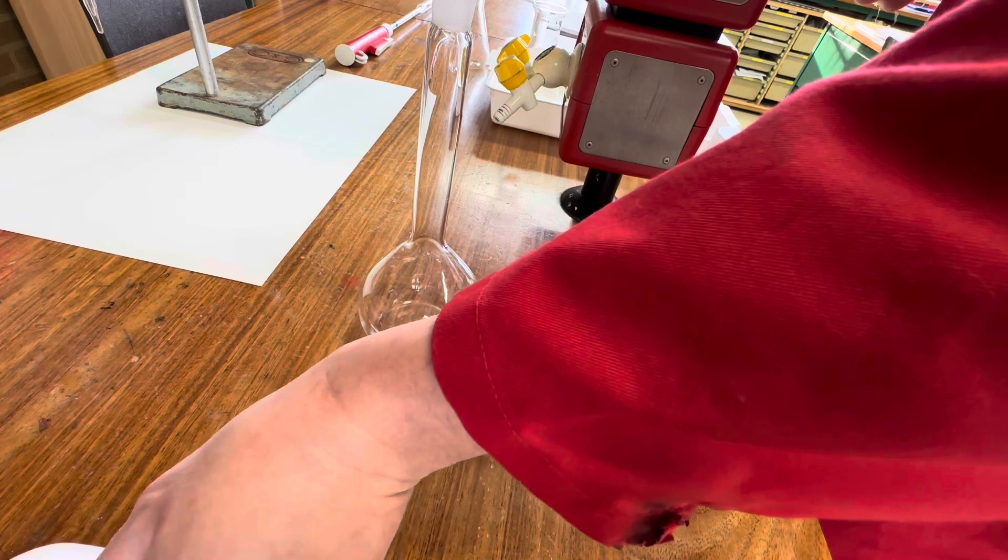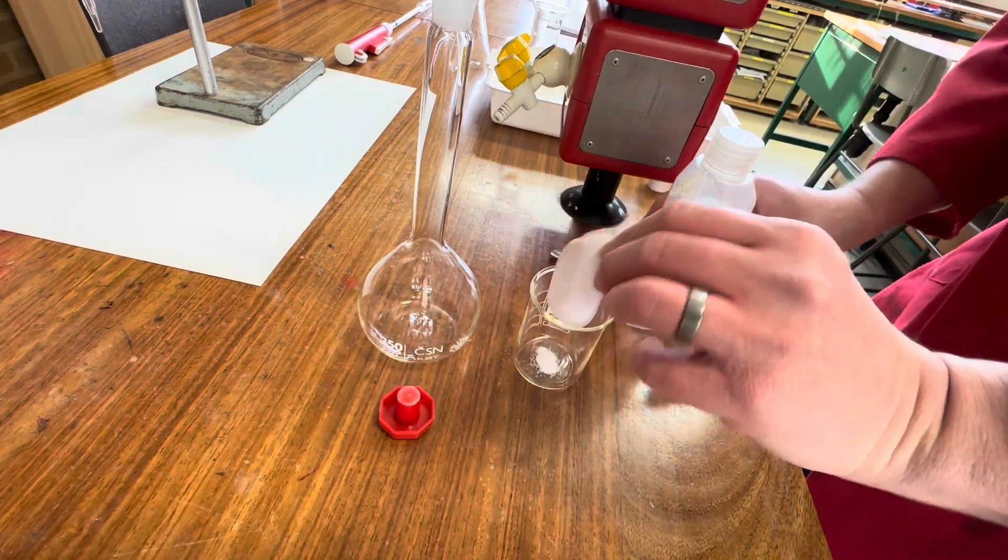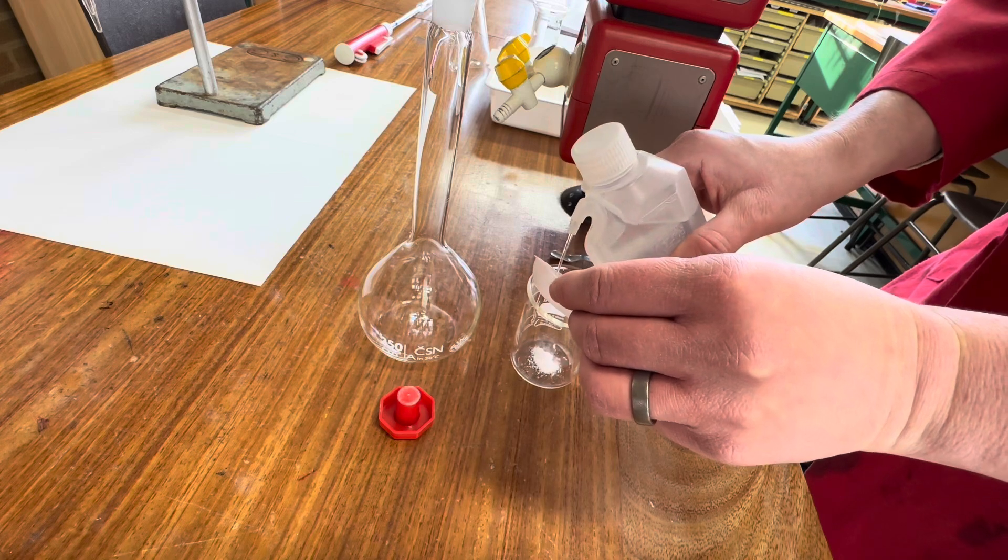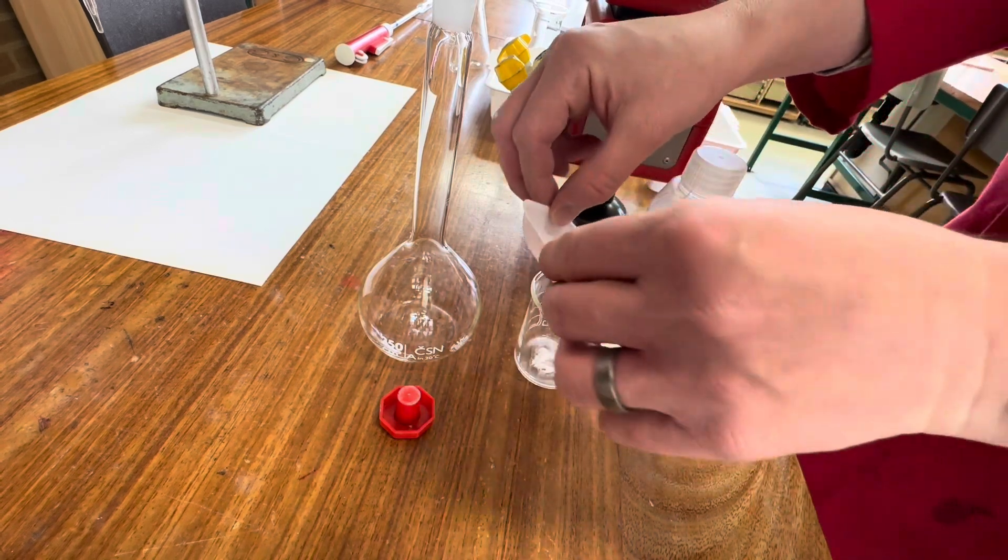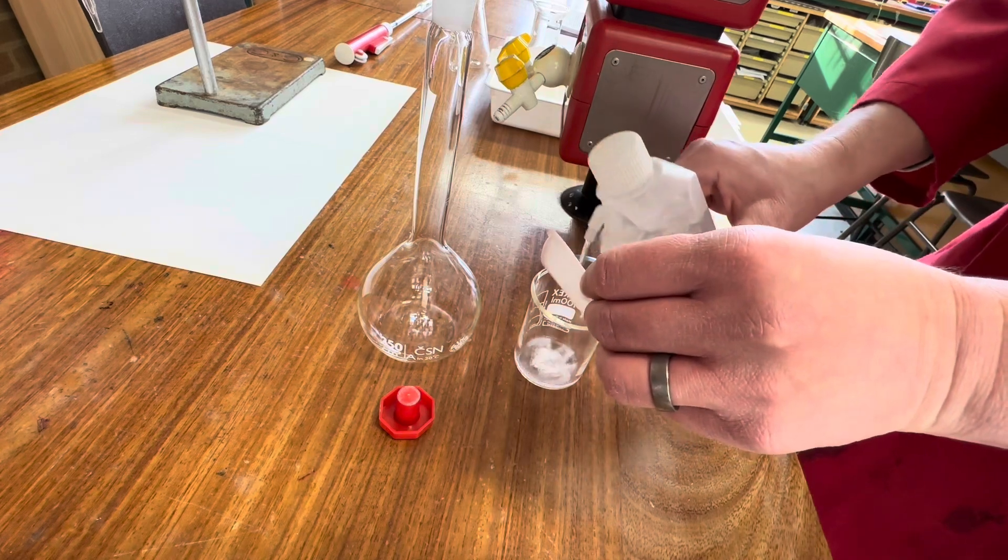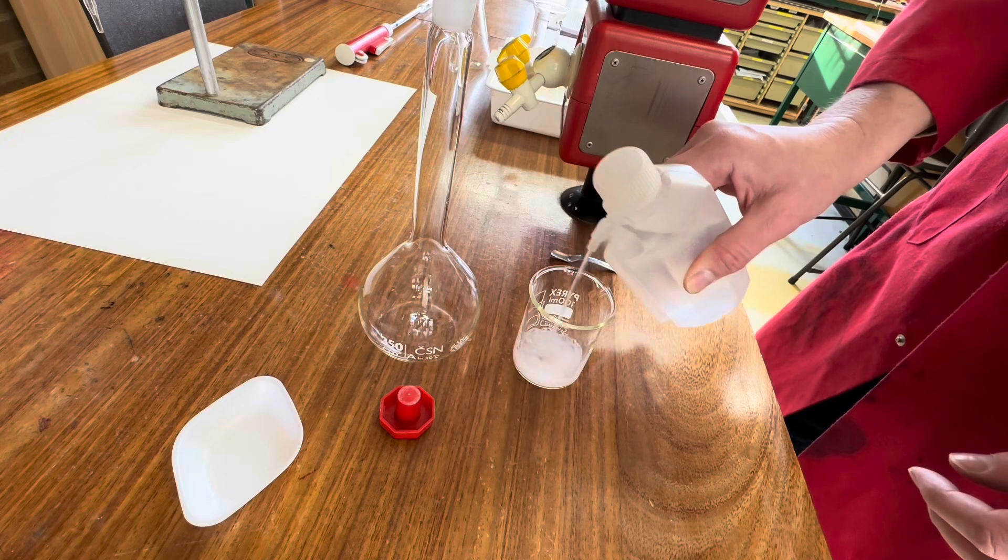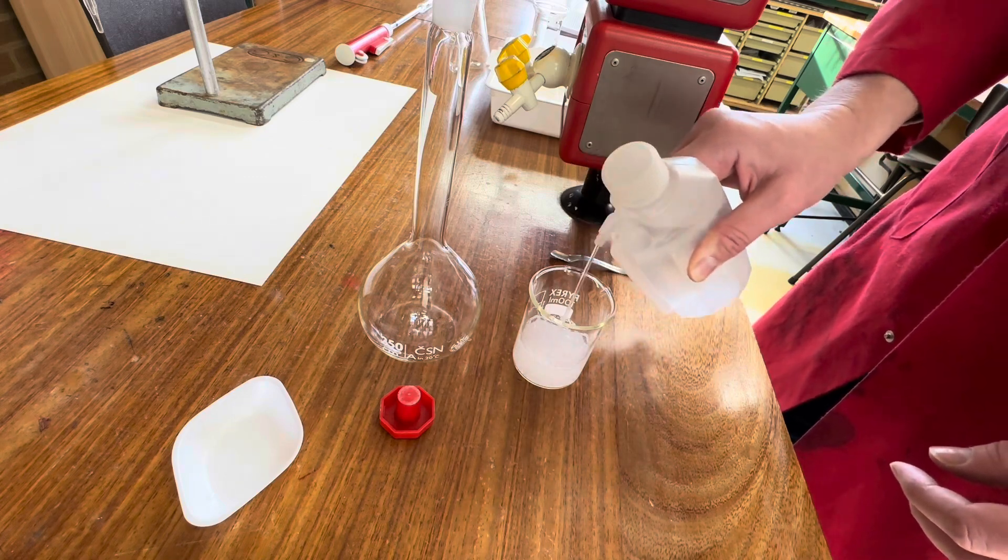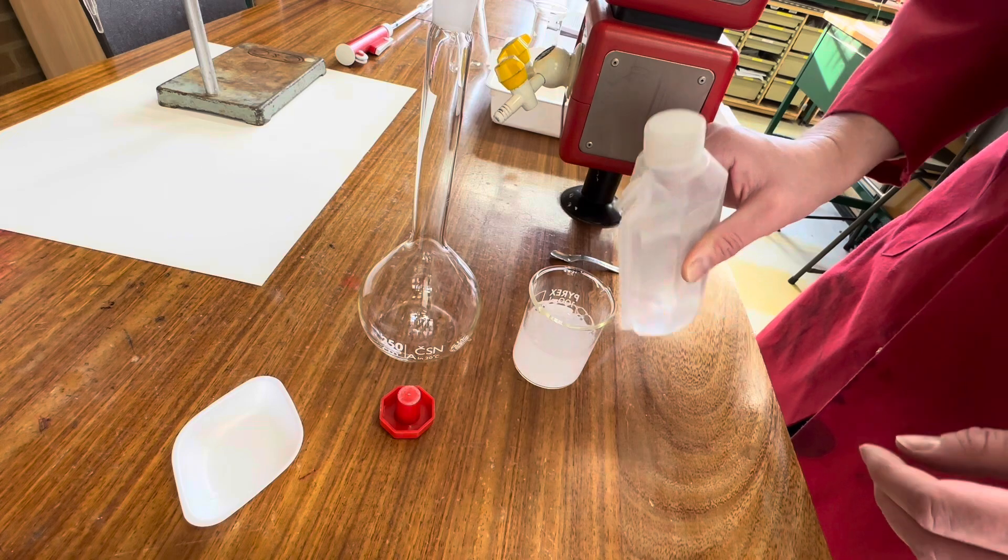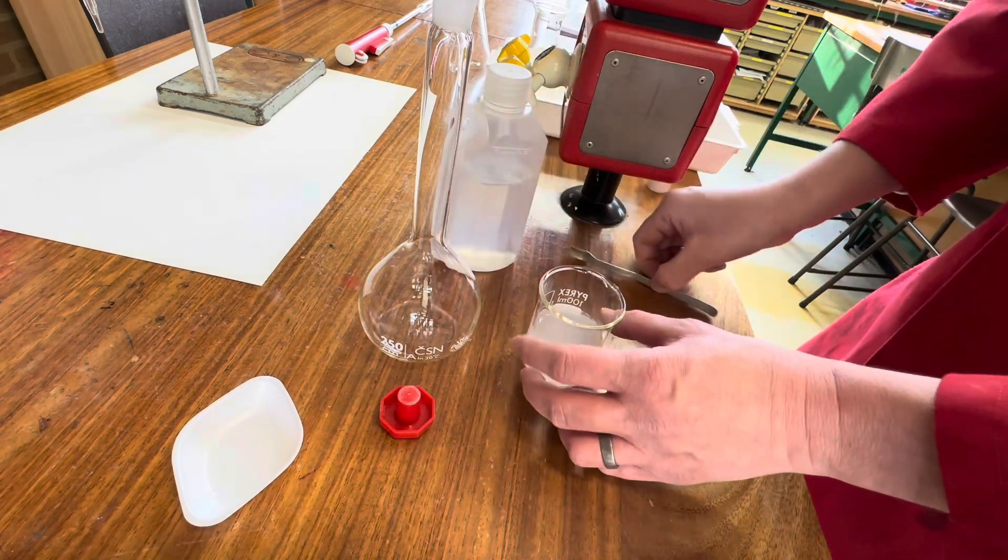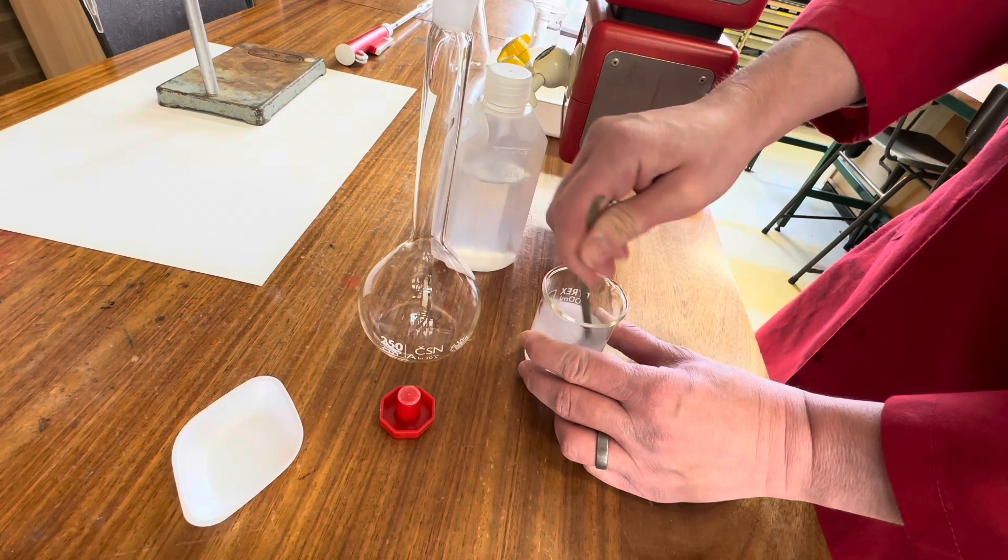So now we're going to make our standard solution. We're going to rinse the powder off the weighing boat into here, making sure that all of it is in there. The next step is we're going to add some water. So long as it's less than 250 milliliters, that's fine. But we want to see it all dissolve. We're going to stir it until it's all gone.